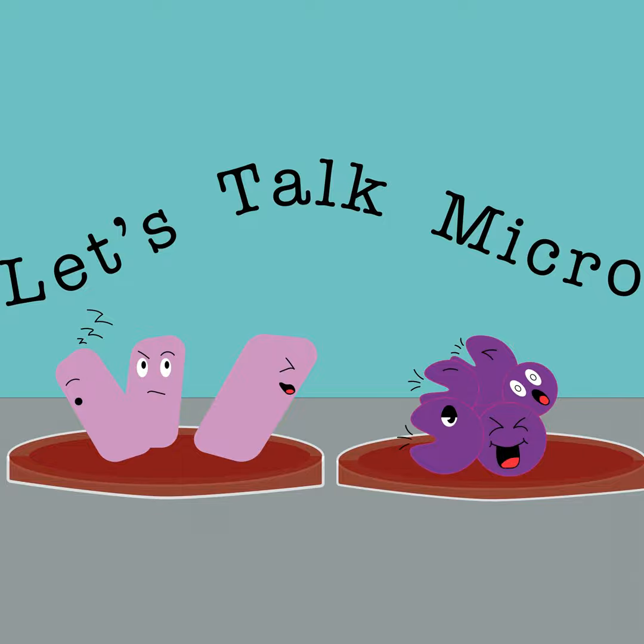And I will mirror what Kathy said about the equity and inclusivity part of it. I had students whose children were at home homeschooling, and they were hopping in on the scope sessions, and they were controlling the microscope. And it was just really great to hear all those extra stories that we don't hear, because our students are usually right in front of us for 3 hours. And such an expensive piece of equipment, the students would never have been exposed to it, never have been able to play around with it. So that was really a big plus.